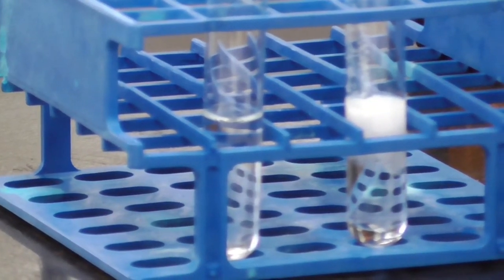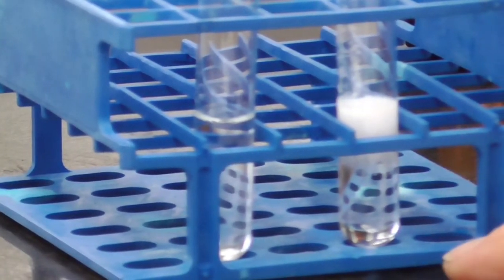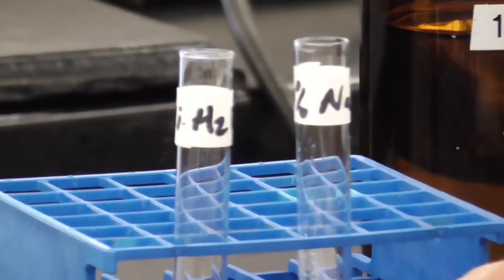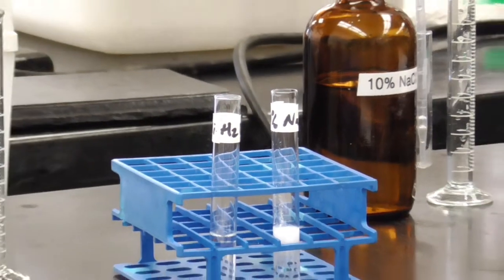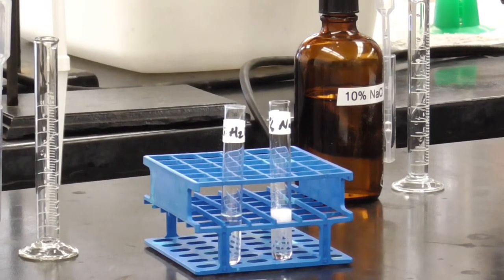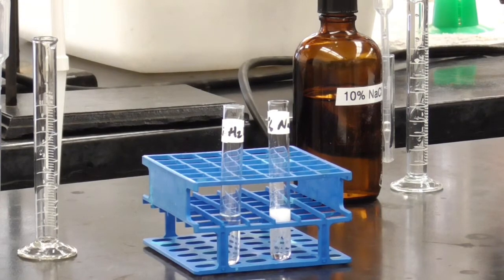I'll let the camera zoom right in on those 2 test tubes. On the left, we have a negative. If there's no chloride, that's the result we get. This is our positive. There is chloride, that's the result we get. So when we are testing some solution in the lab for chloride and we do the silver nitrate test, that's what we're looking for. That would be a no and that would be a yes. We do these ahead of time so that we know what to look for. We know what a negative and a positive is like. So there we go, that's chloride.